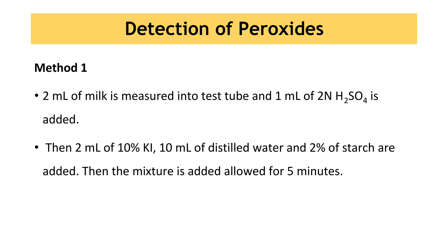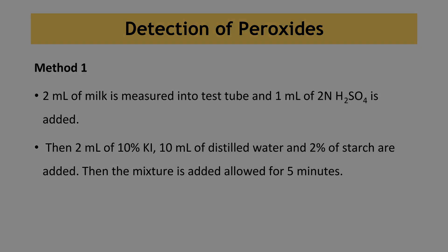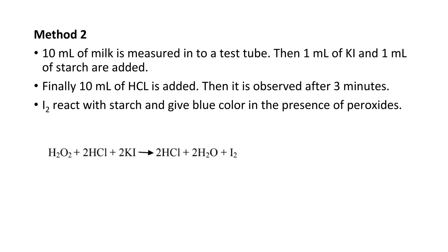Now let's see how to detect peroxides, which are used in milk to prevent spoiling. There are two methods. For Method 1, 2 ml of milk is measured in a test tube and 1 ml of sulfuric acid is added. Then 2 ml of 10% potassium iodide, 10 ml of distilled water, and 2% starch are added, and the mixture is allowed to stand for 5 minutes. For Method 2, 10 ml of milk is measured into a test tube, then 1 ml of potassium iodide and 1 ml of starch are added. Finally, 10 ml of HCl is added and it is observed after 3 minutes. I₂ reacts with starch and gives blue color in the presence of peroxide. Here you can see the chemical reaction.